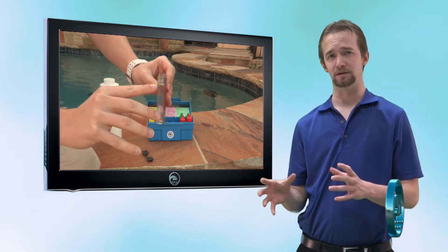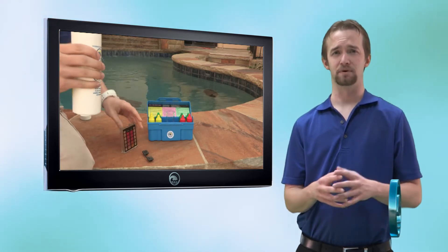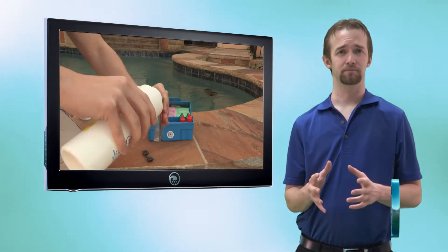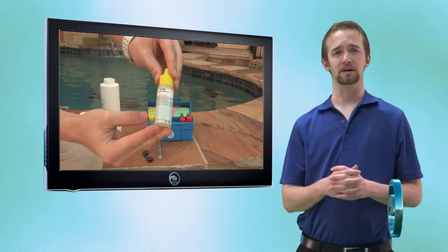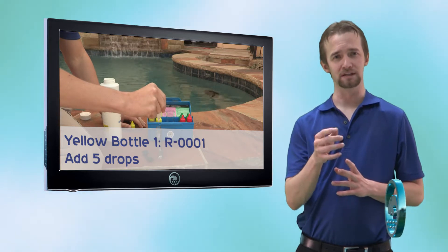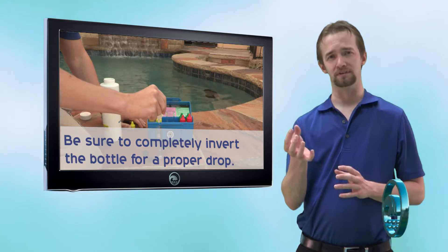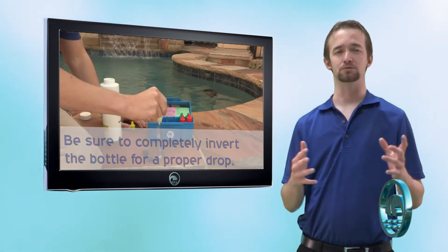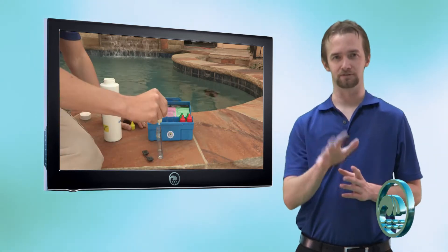Take a proper pool sample, take that water, and fill it up to the mark at the top of the comparator compartment for chlorine. Now take the very first yellow bottle, which is R0001, and hit that sample with five drops. When you do a drop, make sure the bottle is completely inverted so that you get a proper drop. If you hold it to the side or at an angle, you risk only getting a half to three-quarters of a drop, which will give you an inaccurate reading. With the bottle completely inverted, do five drops.